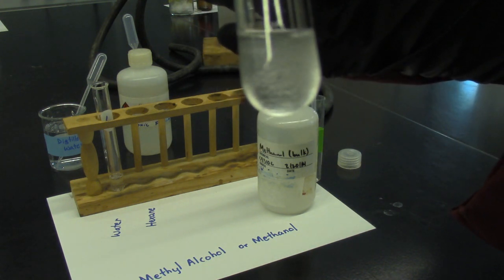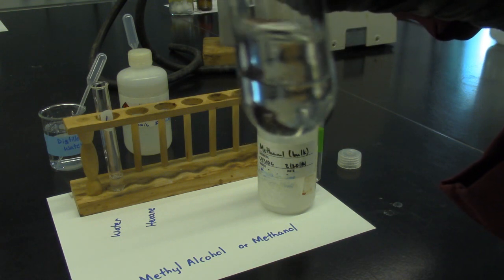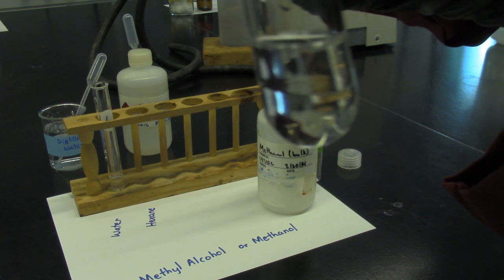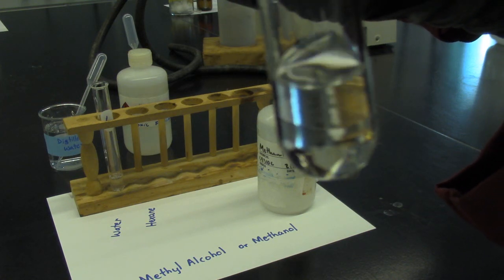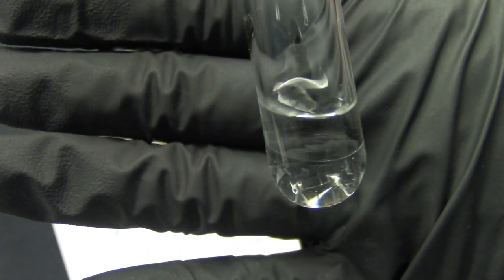Shake it. See if you see a line, maybe with a darker black background. Take down the observation. So methanol with hexane.